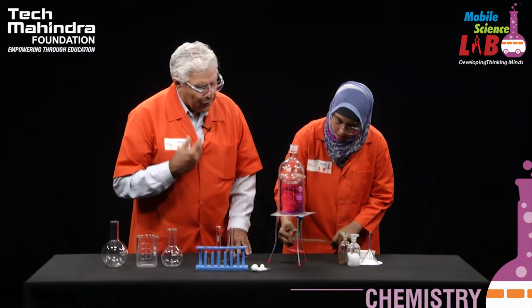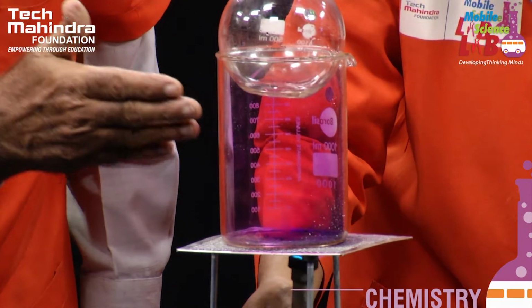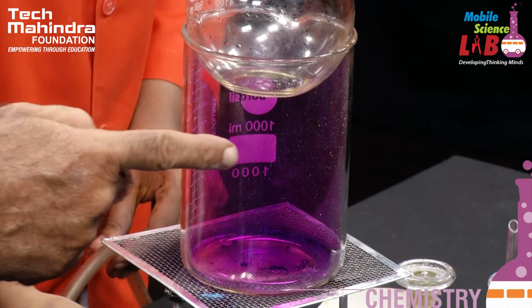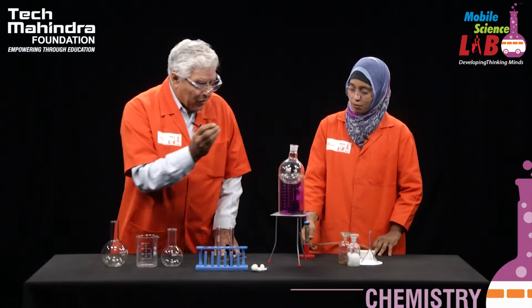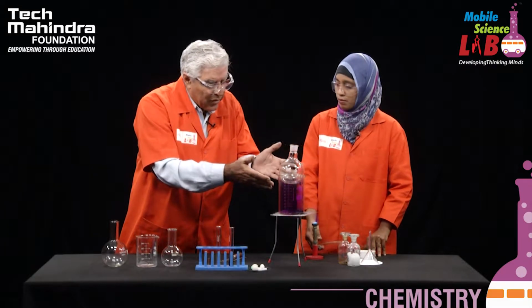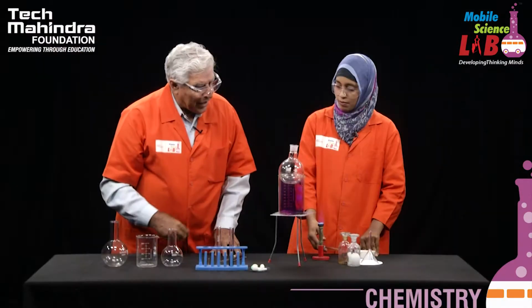Not totally once for all, but gently go on, so that when the vapors come and rise and touch the surface of the round bottom flask, as it is, you can see flat bottom flask, it will crystallize over there. Viewers and children, you can see very many shiny specks around here. Now this is iodine, which was solid, has been heated. It got converted into vapor directly, and that vapor, when it came in touch with the cold surface of the beaker as well as with this flat bottom flask, it has condensed into small shiny crystals.